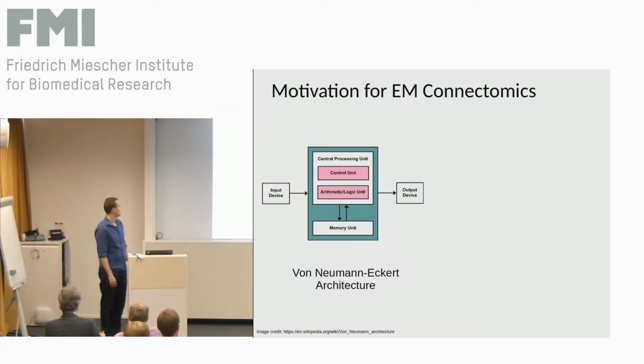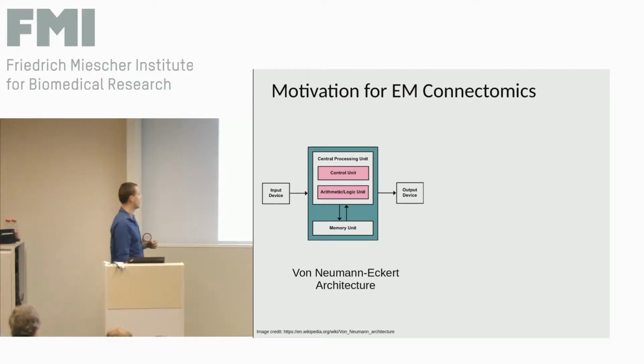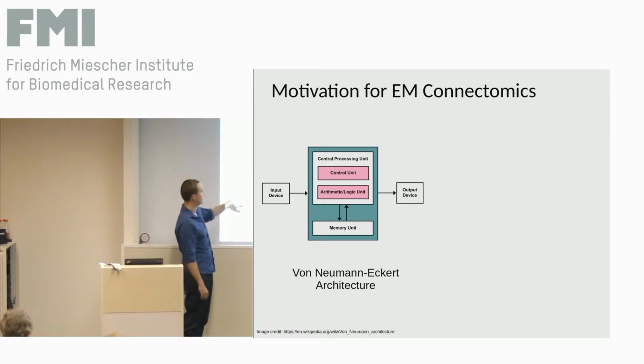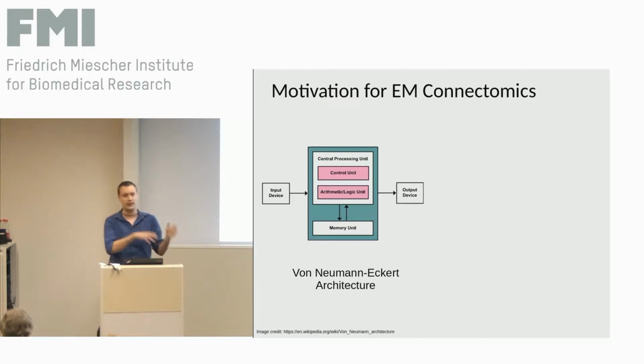And first, I want to give you a short motivation of why to do EM connectomics, mapping brain circuits using electron microscopy. So many things that are also, in general, the topic of this workshop boil down to the von Neumann architecture, where conceptually the central processing unit and the memories are separate things.